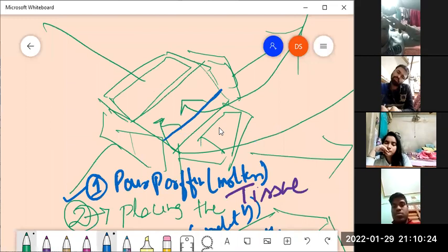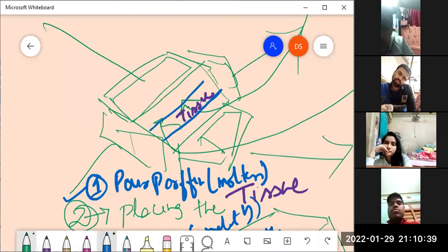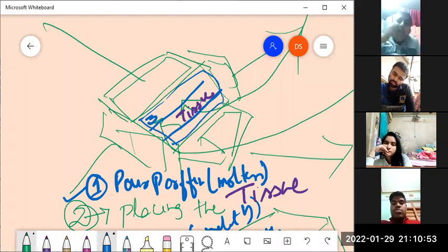That means the first step is over. Thereafter, in the second step, you place the tissue. Then, as the third step, you now cover the remaining volume again with molten paraffin. That is how this entire volume is now having the molten paraffin.